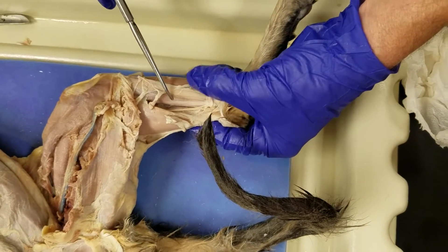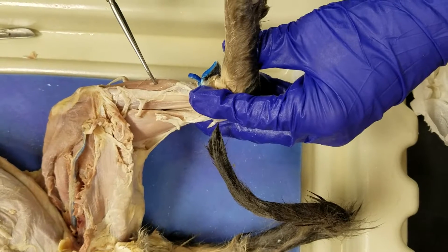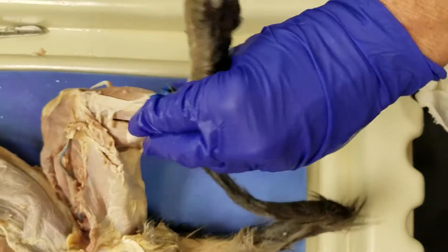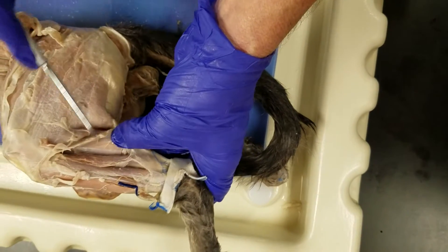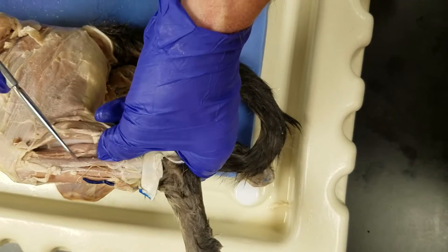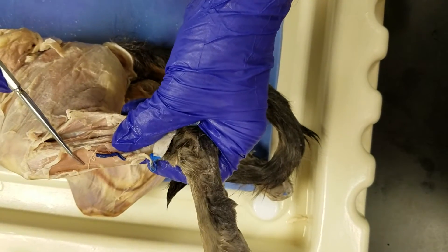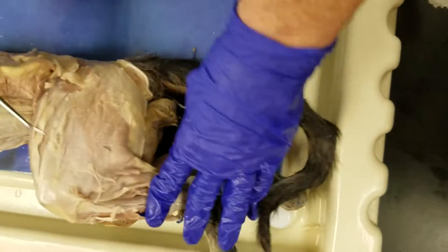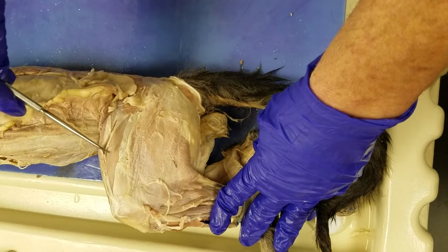Flexor digitorum, tibialis anterior — all the front. Gastrocnemius, soleus, peroneus, extensor digitorum, tibialis anterior, biceps femoris, vastus lateralis.